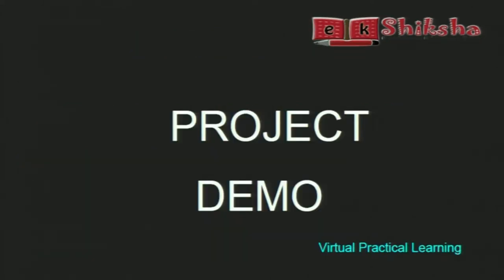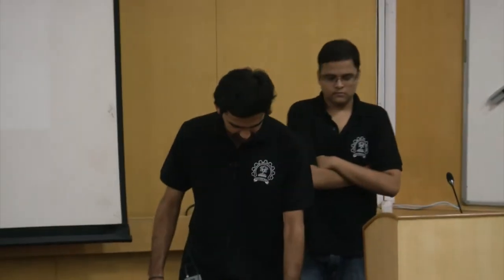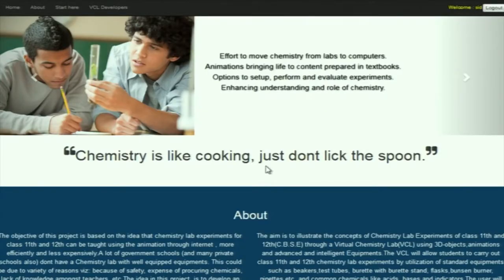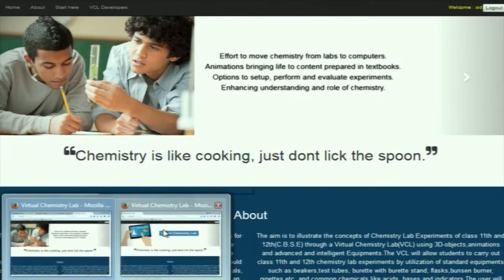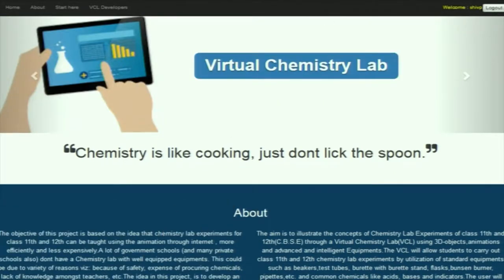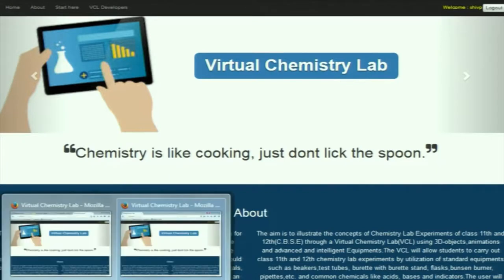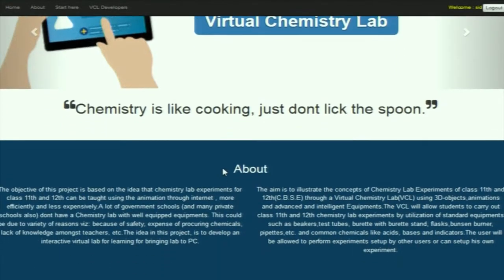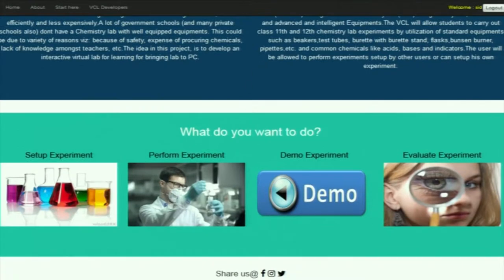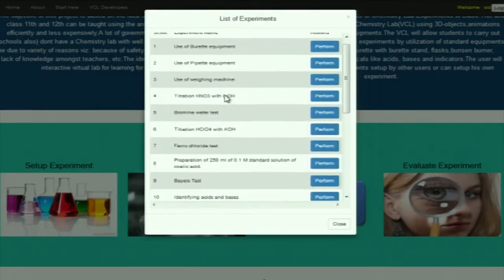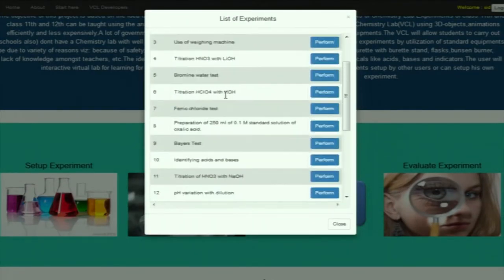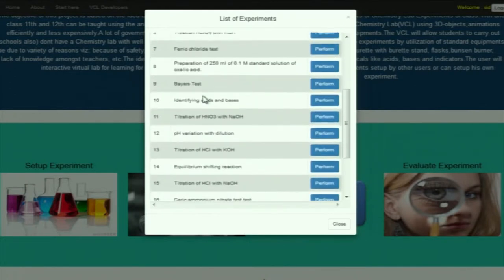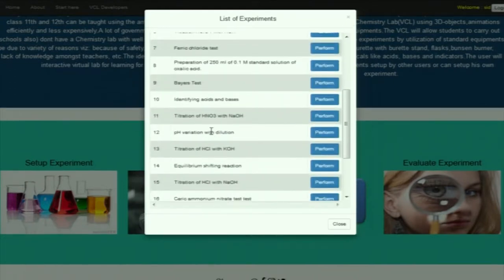Now Siddharth is going to show the project demo. Hi, I am Siddharth Charya and I will be showing you a demonstration of our project VCL. I am logged in to two accounts — one is mine and in incognito I have logged in with my co-intern account. The main functionality we have is we have implemented CBSE class 11th and 12th experiments.